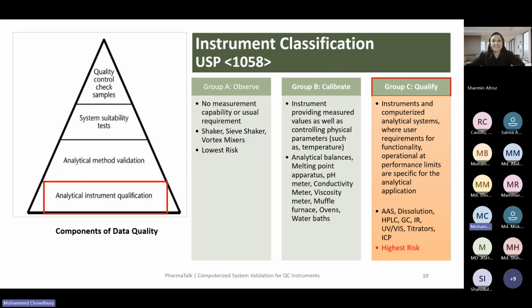For this water bath, we need to ask the question: what parameter can we set in the water bath? Only temperature. So we need to check whether the temperature is actually correct or not. How can we check it? Through calibration, with a calibrated thermometer. This is simple.